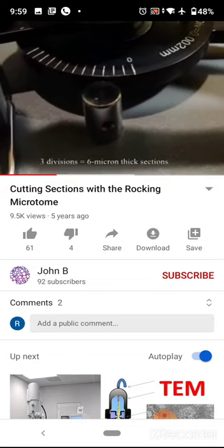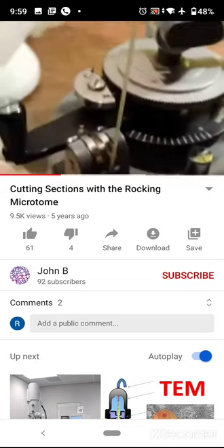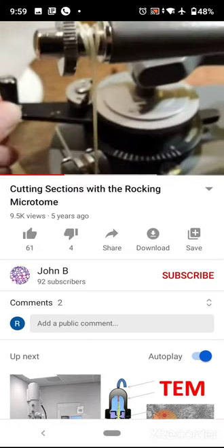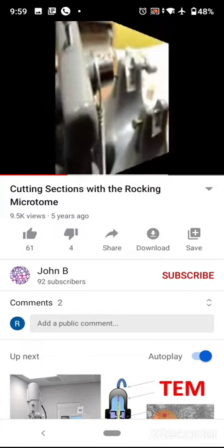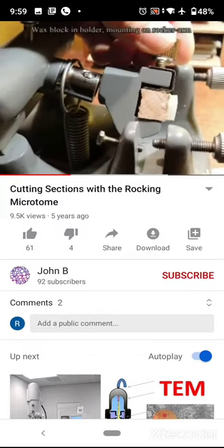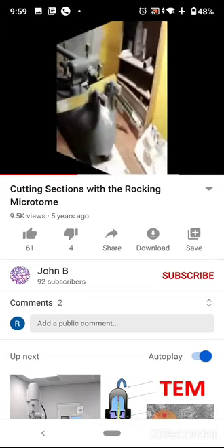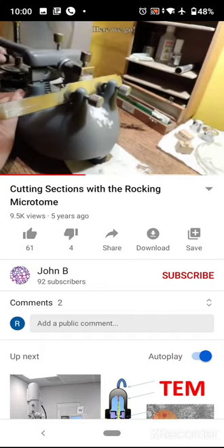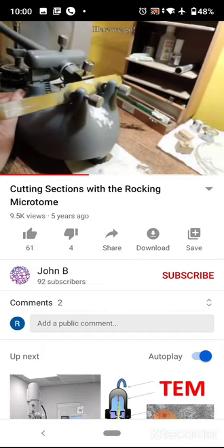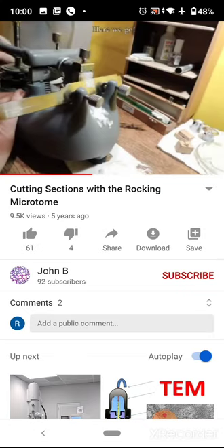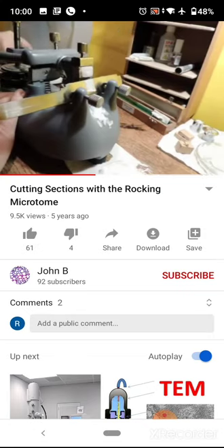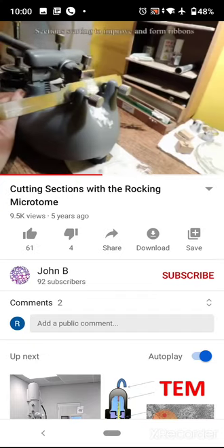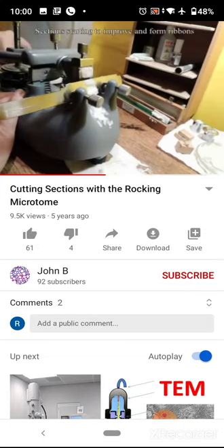In all microtomes, there will be some mechanism to adjust the thickness of the sections — a knob or knurling knob which can be rotated to adjust the thickness. Here the knife is stationary — the buff-colored material is the knife — and the specimen embedded in paraffin wax is moving. Uniform sections are formed.